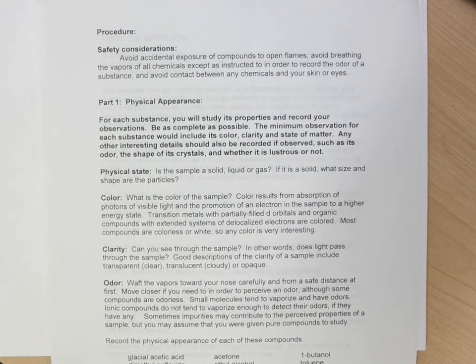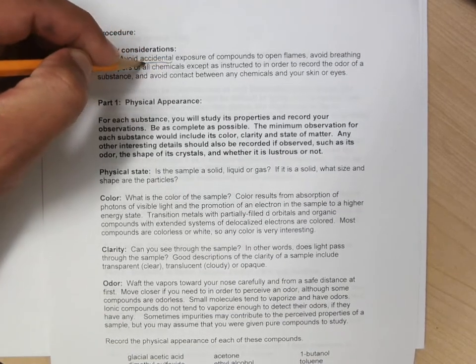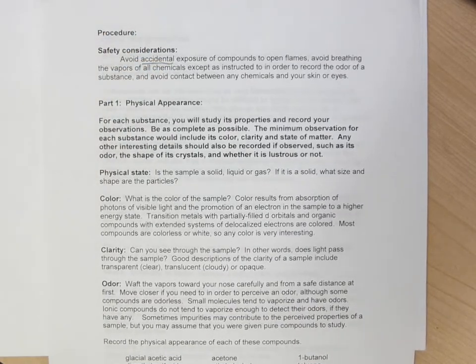Certain safety considerations, we want to avoid accidental exposure of compounds to open flames. One of my favorite warnings is that one because of the word accidental. In this lab we actually try to set things on fire and see whether they burn or not. So it's one of my favorite labs. I've always liked lighting fires and watching them burn in a controlled, safe, non-accidental way.